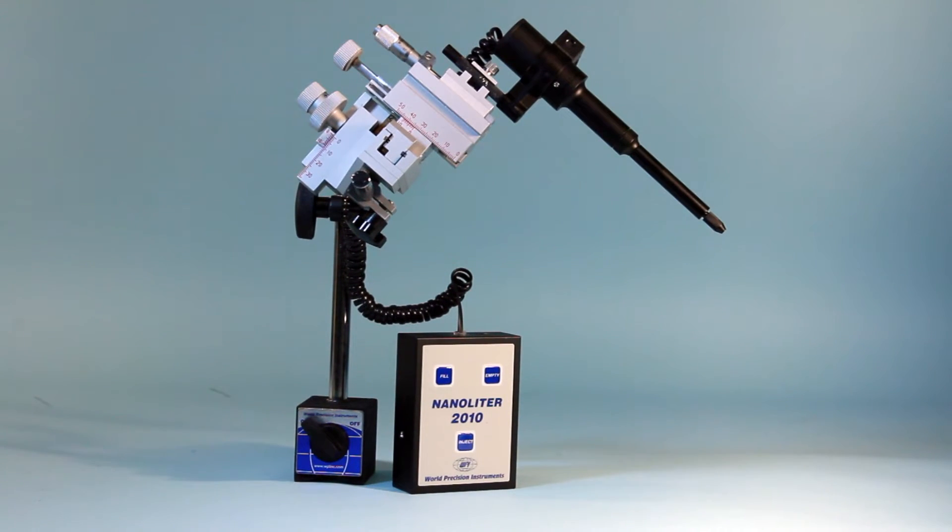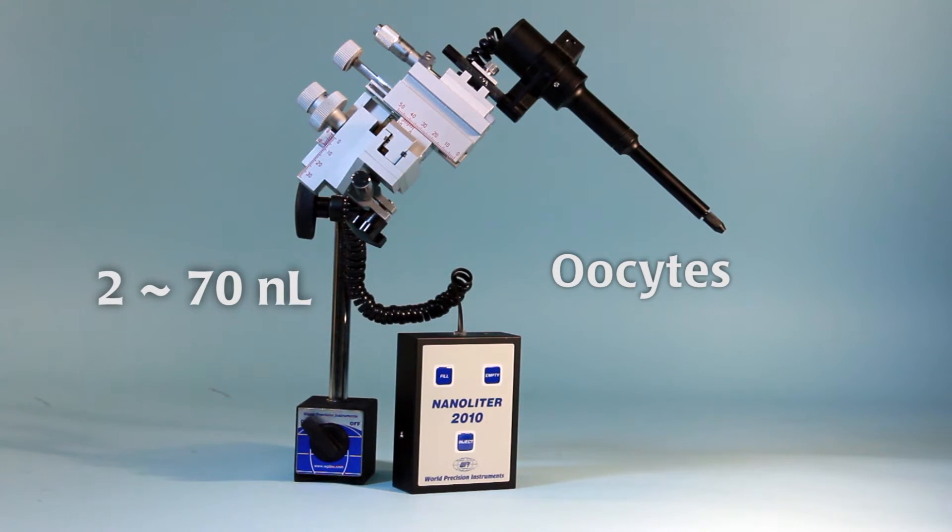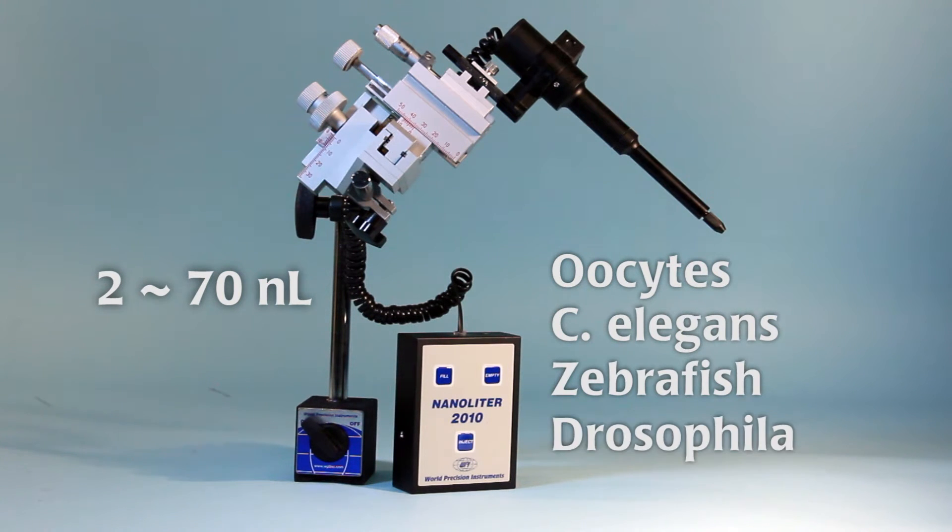WPI's Nanoliter 2010 is designed for microinjections in the 2 to 70 nanoliter range, suitable for injection in oocytes, C. elegans, zebrafish, and Drosophila.